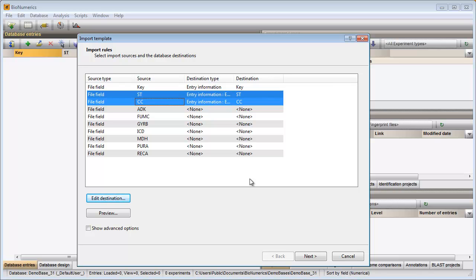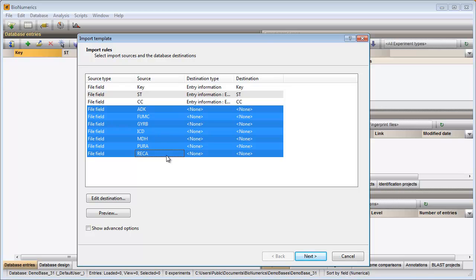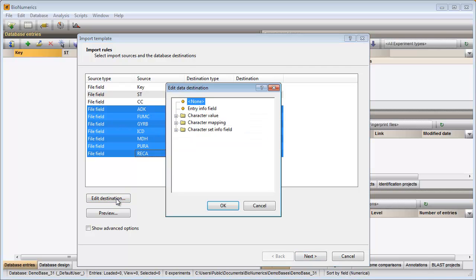Finally, I would like to link my other fields to the MLST character type in my database. With the Shift key I can select the rows in the grid. I then select Edit Destination and select the character type from the list.